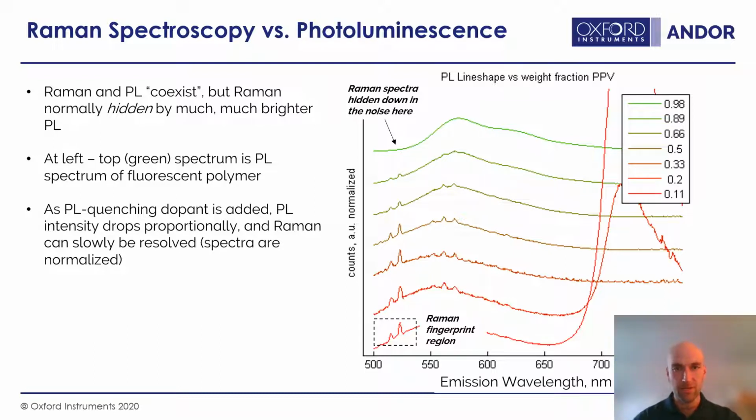So the first is a conjugated polymer dye, polyphenylene vinylene. And you can see here is the undoped. So there's nothing in it. It's just mostly, well, almost pure, and it fluoresces in the green to yellow to red. So this is the photoluminescent spectrum.